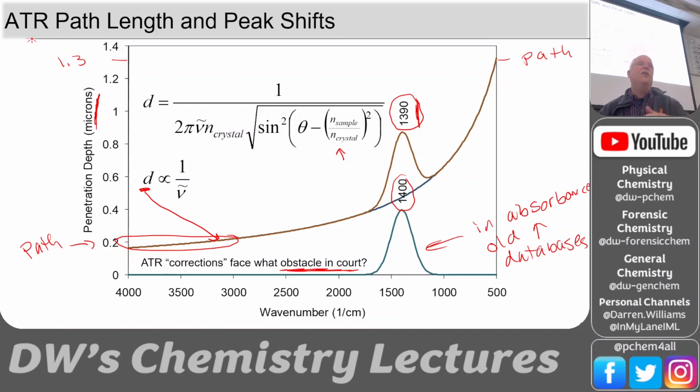So what they had to do is just go back and recollect all of the drug spectra using the ATR. So it's important, if you're going to use an ATR attachment, you should use an ATR database so that the peaks line up the best.